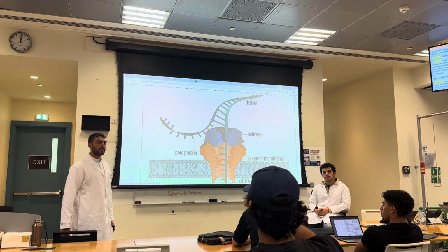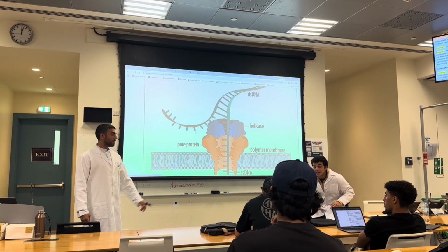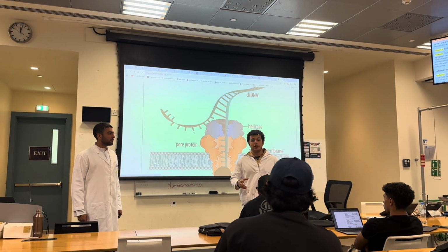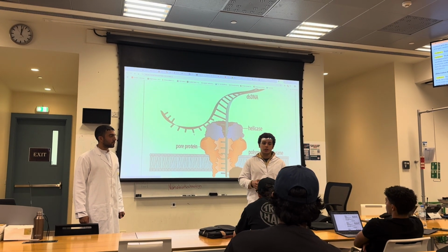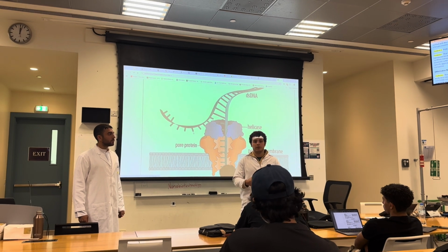Yes, Professor. Are synthetic nanopores used in ONT devices? That's actually a great question. It's a fascinating area of research currently. But as of now, ONT primarily uses biological nanopores because of their precision and ability to interact with DNA.